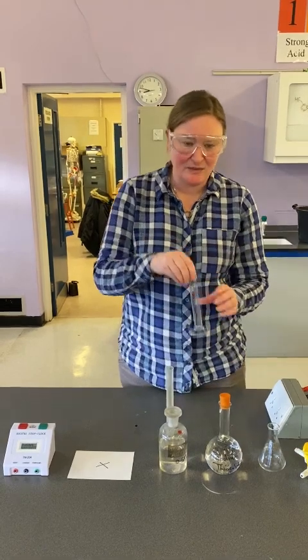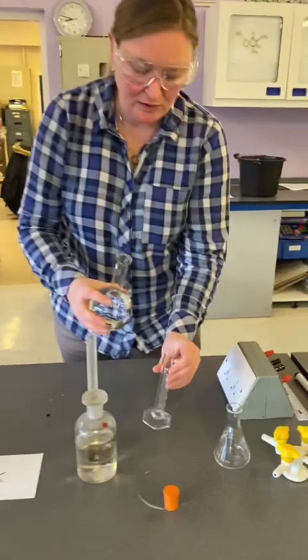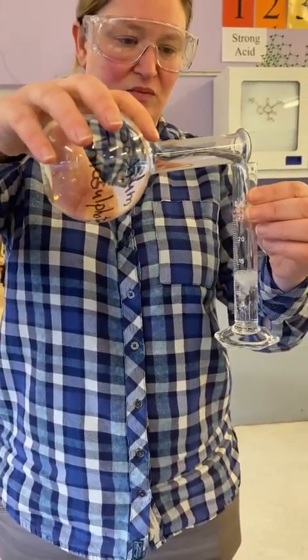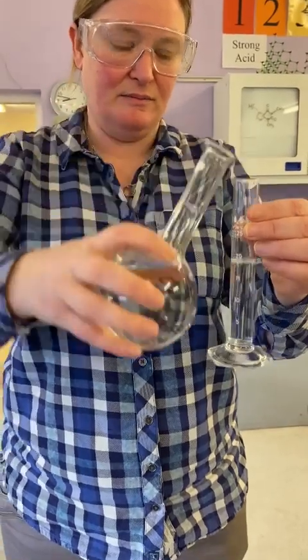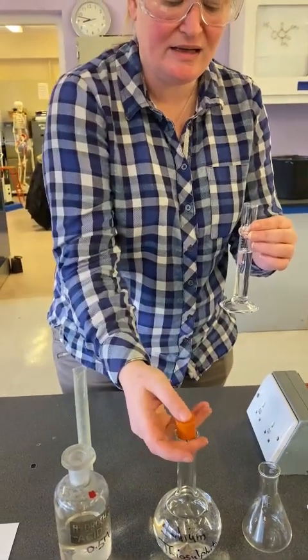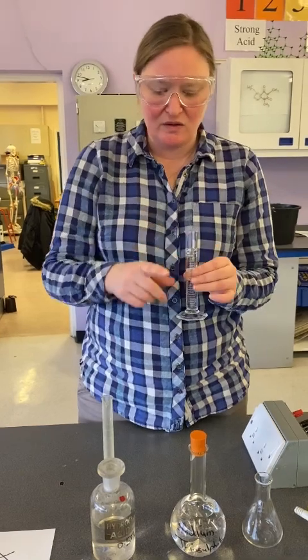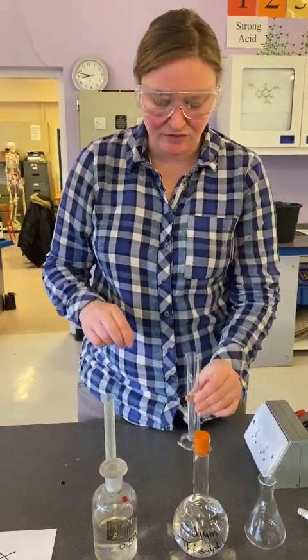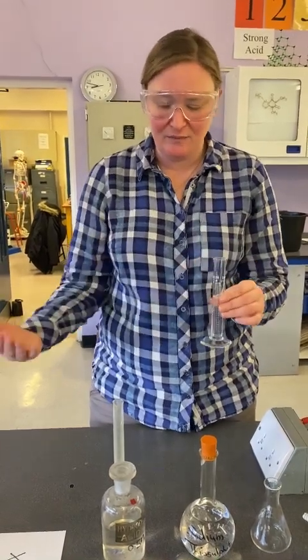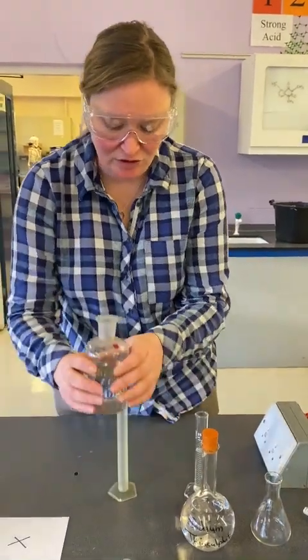I'm going to take a glass measuring cylinder and I'm going to measure out 20 mils of sodium thiosulfate. Don't worry about learning the spelling as long as you recognise the chemical, sodium thiosulfate. And I'm using a glass measuring cylinder so that I can tell it's going to be different from the hydrochloric acid, because if we get those mixed up, they'll start reacting in the measuring cylinder before the reaction starts, and you'll see why that might be a problem in just a moment.